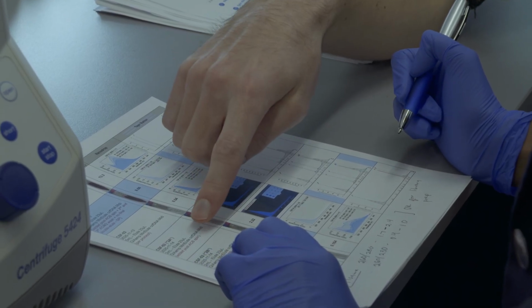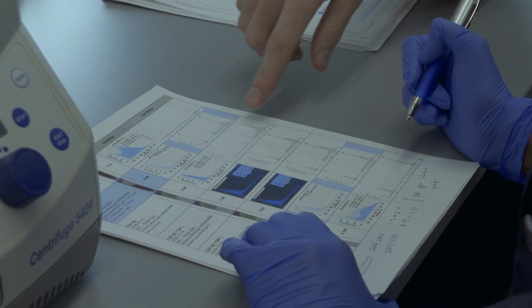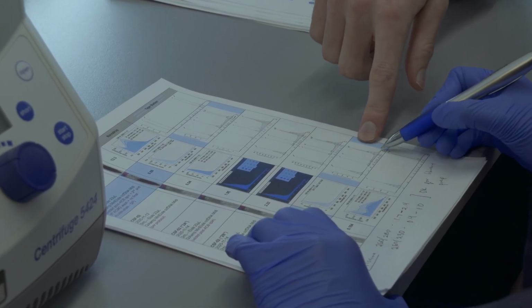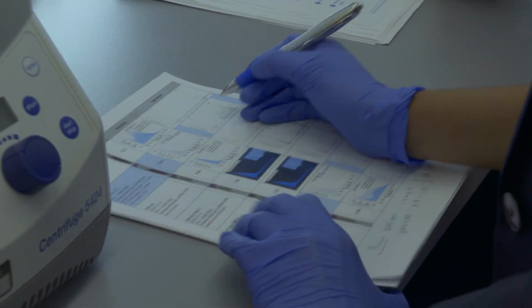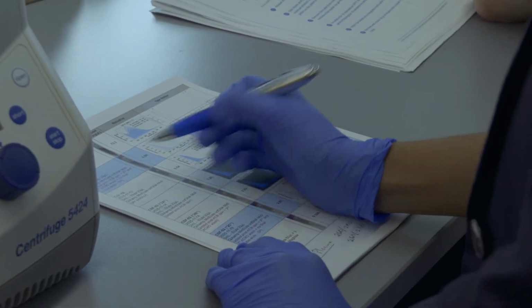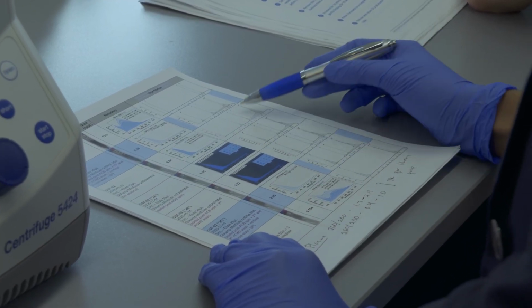We just made protocol modifications, basically more wash steps. The tape looks more or less uniform throughout, but this one probably looks the best. Yeah. So definitely we are not gonna do number one. Correct. Yeah. Number two here, I think we should do it.